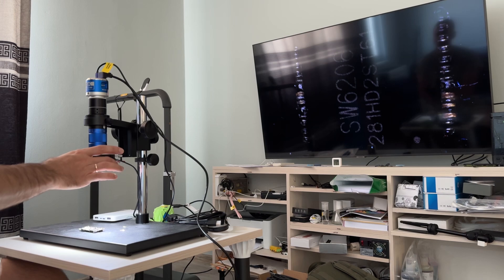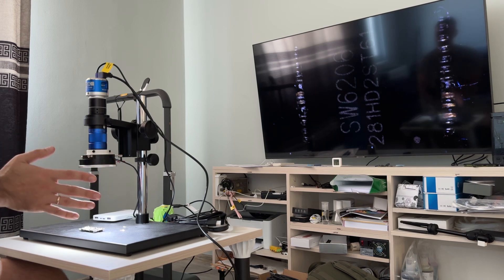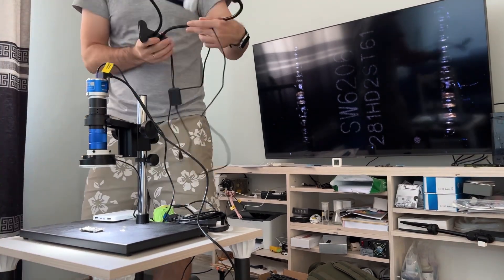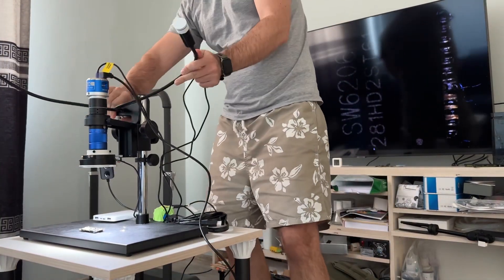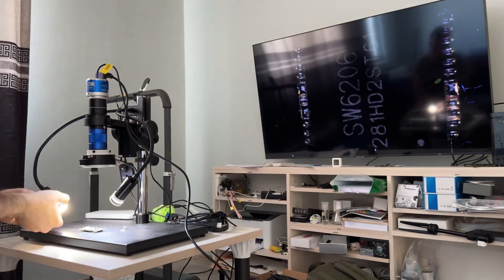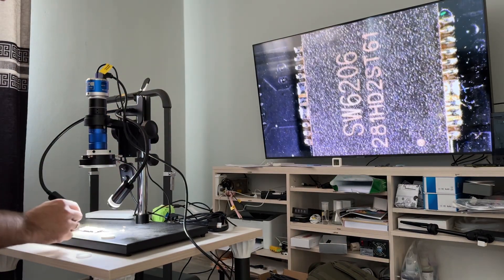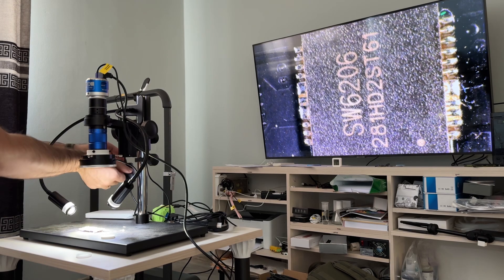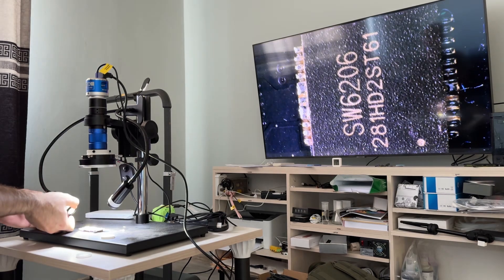But you can see it's too dark. So now we add our light. And now we rotate our filter — we can cut one. We can cut this one.